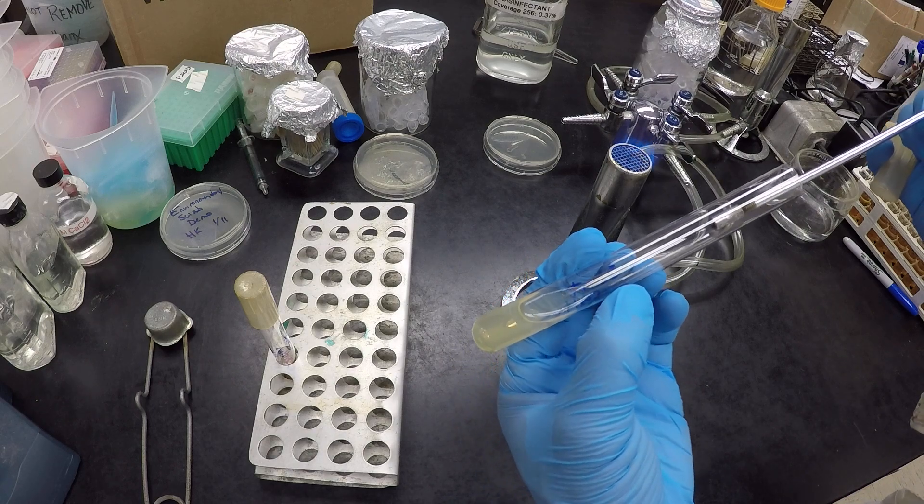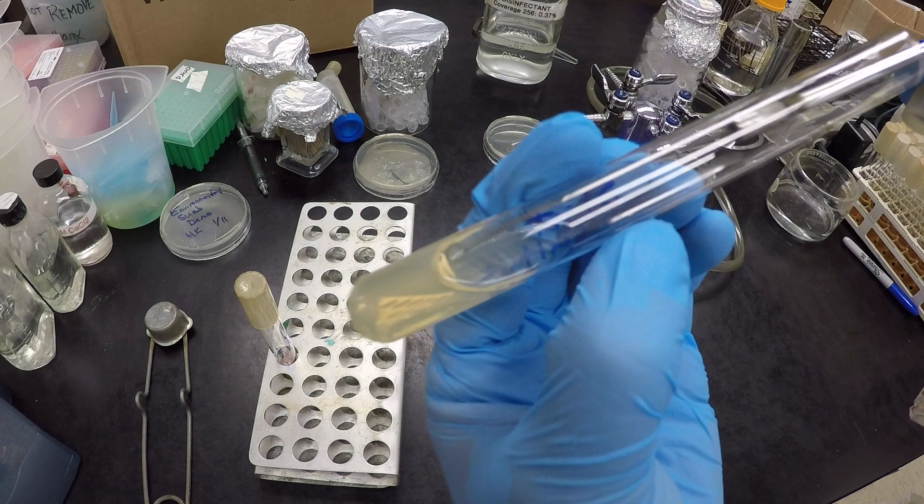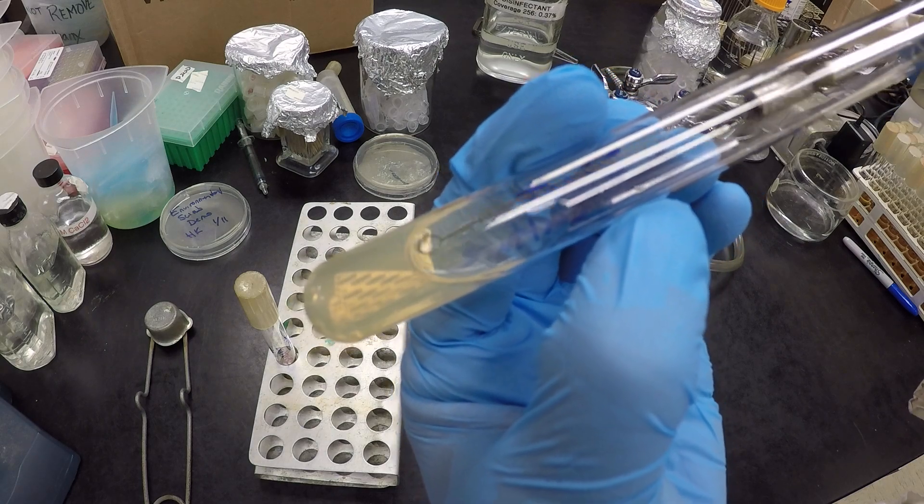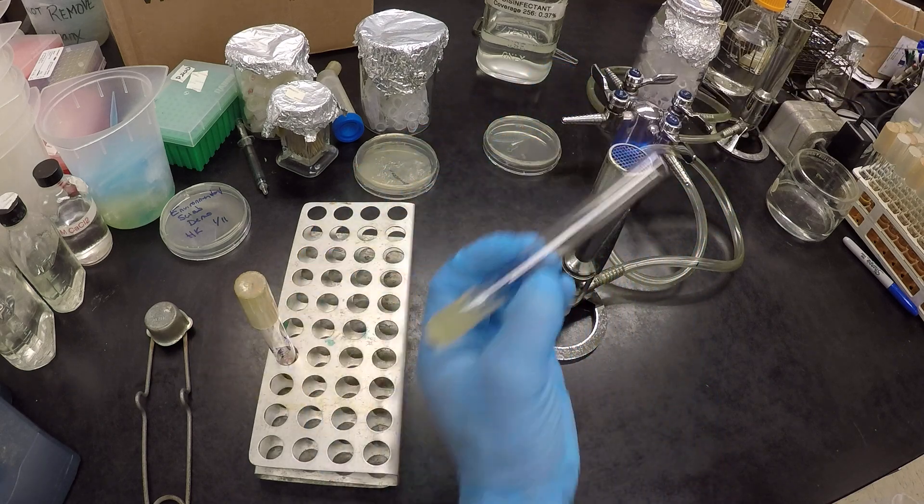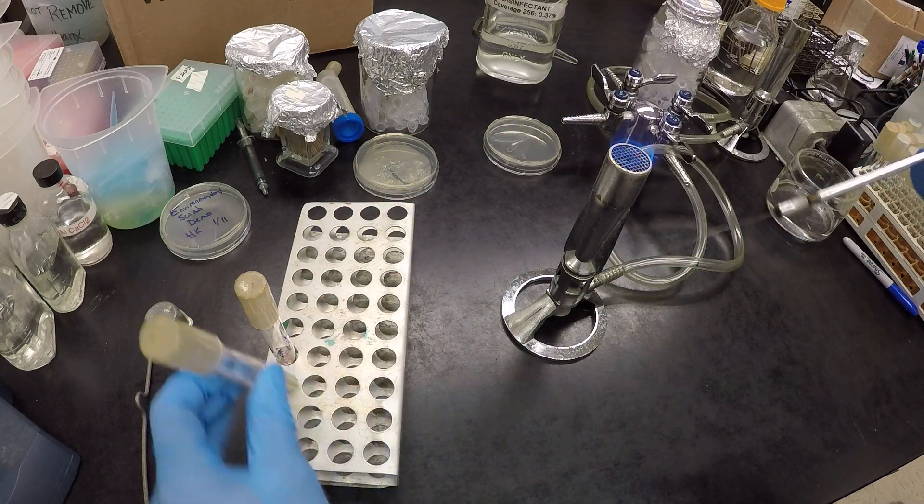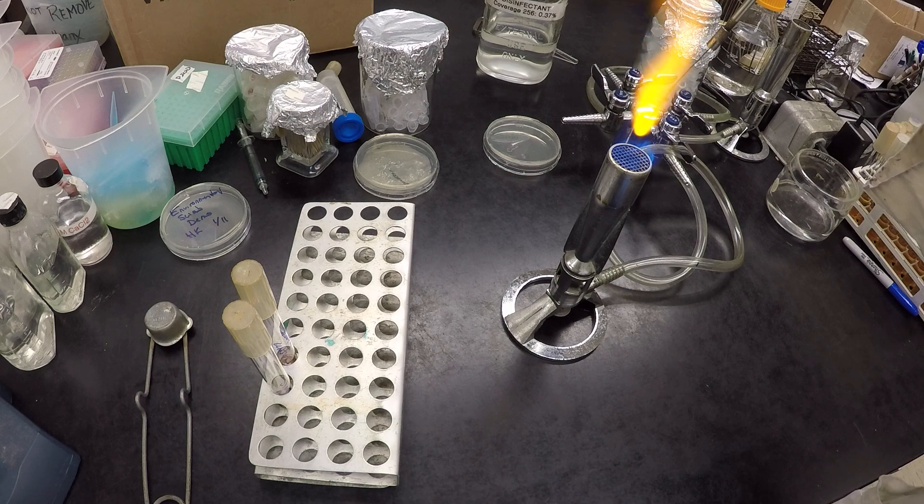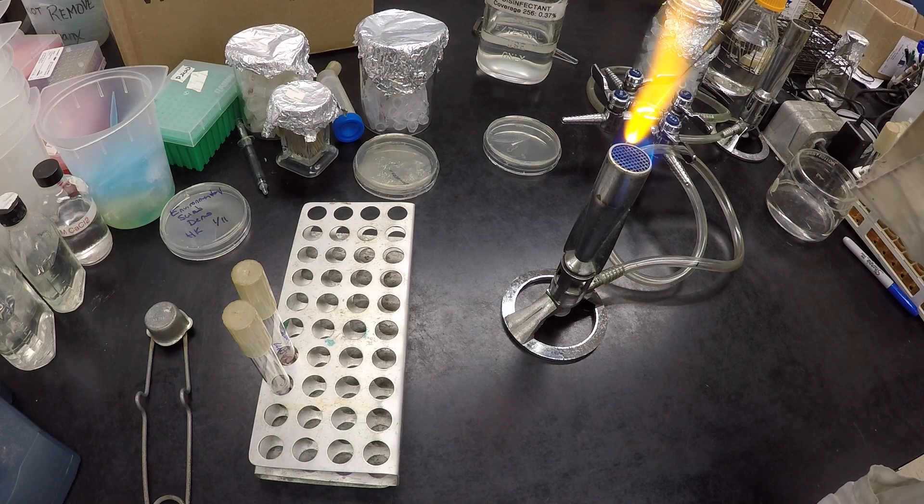Now, we let the wire loop do the work, touch the bottom of the slant, and then cover the slant. Just like that. Flame, put away, and sterilize, and that's it.